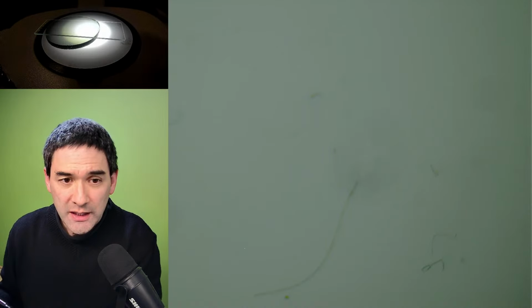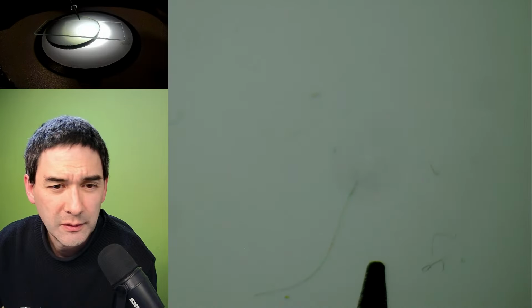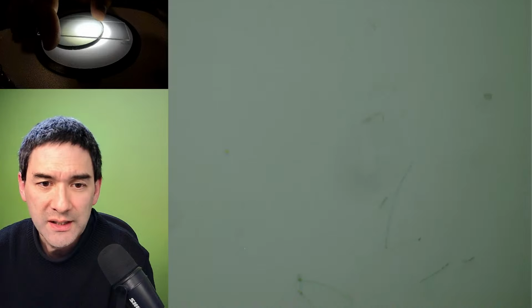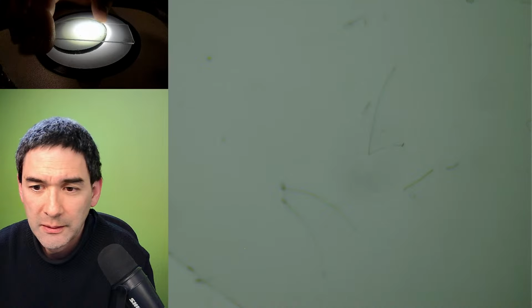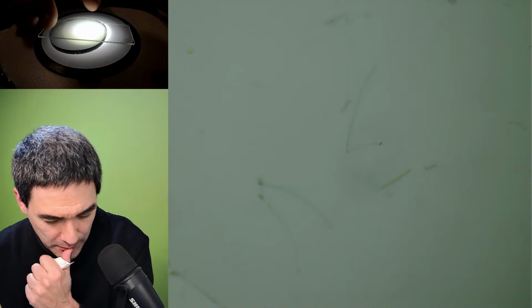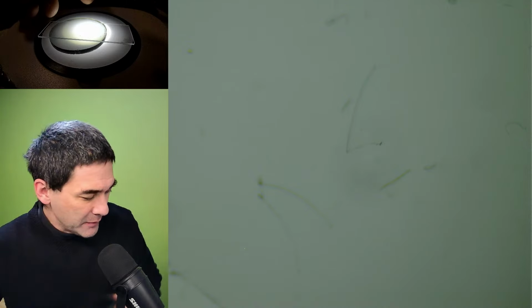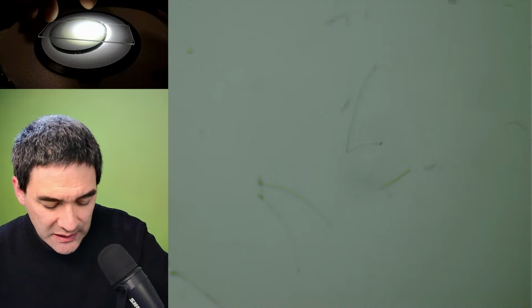But this is actually nice. Here we've got an individual one. Where is it? So let's test this. It quickly melted. That's one way you can go through your fibers and test what they actually are. Let's try the following just for the fun of it. Most of the fibers, however, might not be synthetic.